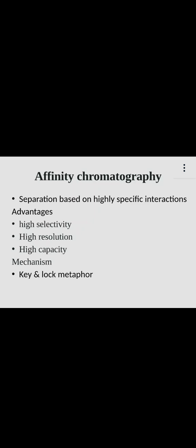So this technique can be used for separation or for study of interactions between the analyte and the stationary phase. A high degree of purification can be attained with affinity chromatography.